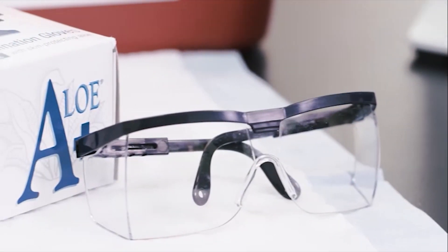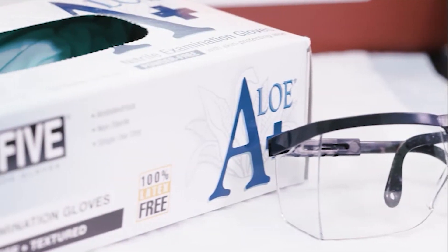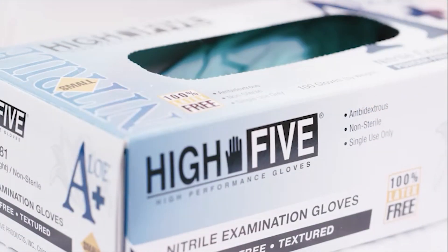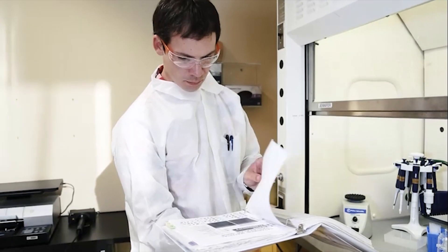As in any laboratory procedure, proper PPE must be worn. Please check with your laboratory's SOP for this information.